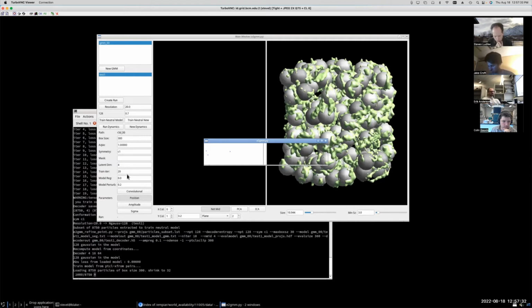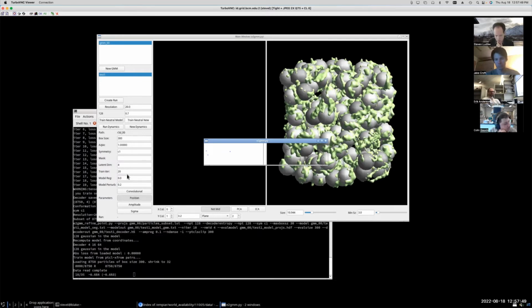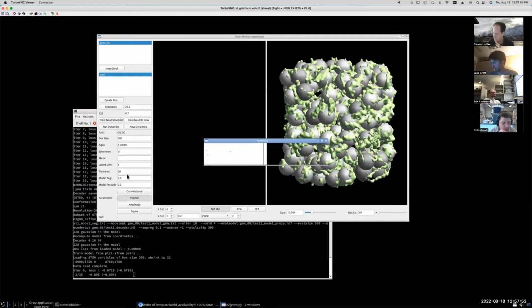Anyone have any questions while we're waiting for this to run? I'm getting all sorts of errors trying to run it myself. Okay. What sorts?